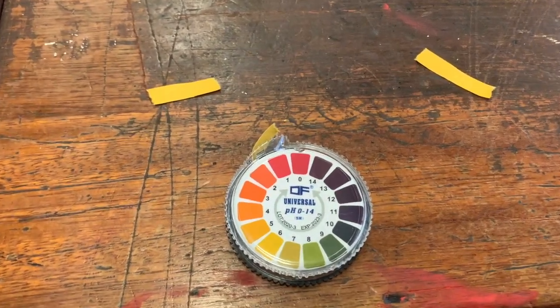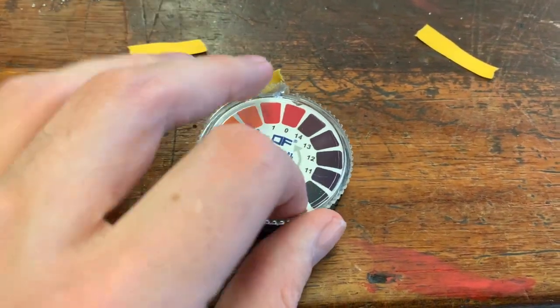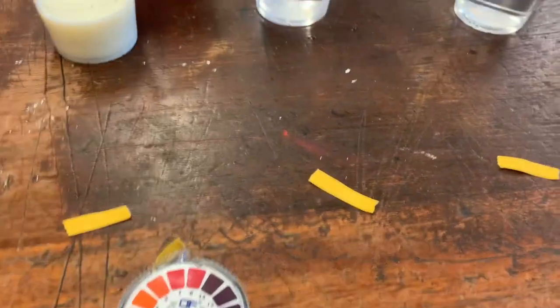When you're using the universal indicator paper, you need to make sure that your scale is with you, because you need to be able to read the colour off the scale to work out what the pH is. So let's try and do this experiment.